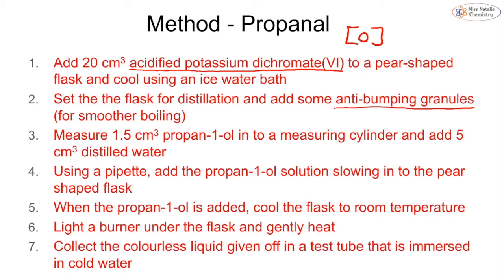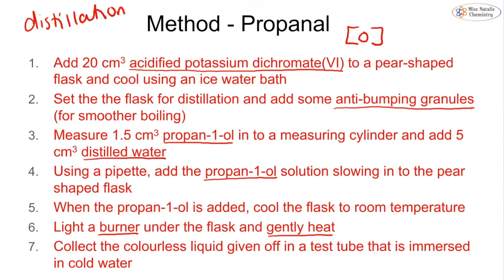We put 1.5 cm³ of our alcohol into a measuring cylinder and dilute it with 5 cm³ of distilled water. Using a pipette we slowly add the propan-1-ol into the pear-shaped flask. Once added, we cool the flask to room temperature and then light a burner underneath to gently heat. The colourless liquid given off is collected in a test tube immersed in cold water — that should be our aldehyde. Notice we're adding it slowly and not using reflux; this is distillation by addition.